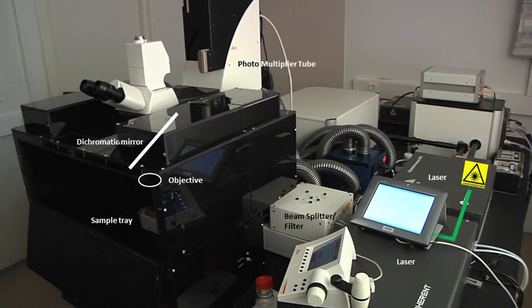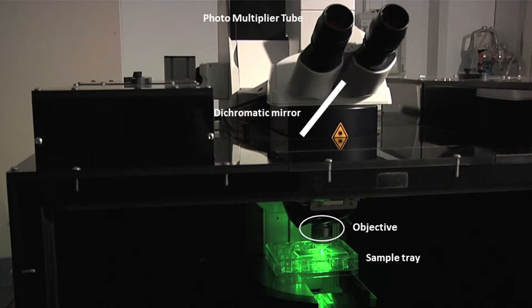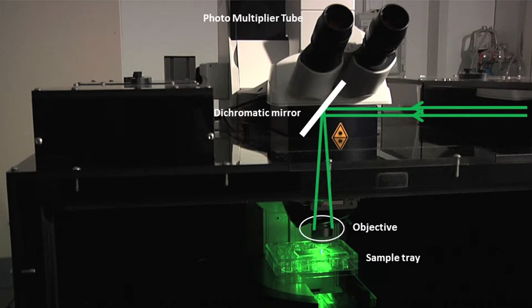Inside the microscope, laser passes through a lens which then focuses the light onto the sample. If the location is targeting a fluorophore, it will emit light of a different wavelength that is detected by the photomultiplier tube.